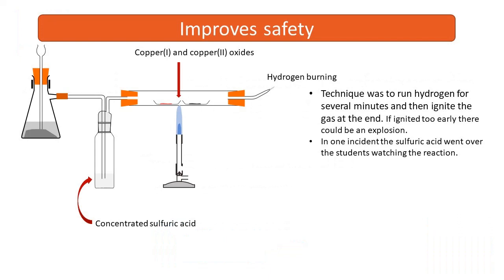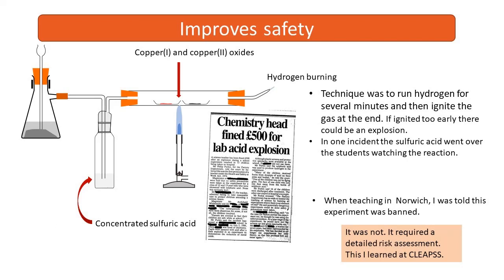Although I had been interested in small-scale experiments when teaching in the 80s, I think it was this experiment that really brought it home to me. Hydrogen was passed through concentrated sulfuric acid to dry it and then over copper oxide to reduce the copper. The hydrogen was burnt at the end to avoid the copper reoxidizing on cooling. The problem was that if you let the hydrogen in too early it could explode in the apparatus. In one such incident the sulfuric acid went all over the children at the front, and this was investigated by the Health and Safety Executive. In the ensuing prosecution the teacher was fined £500, and this was the first prosecution of a teacher in science by the Health and Safety Executive.